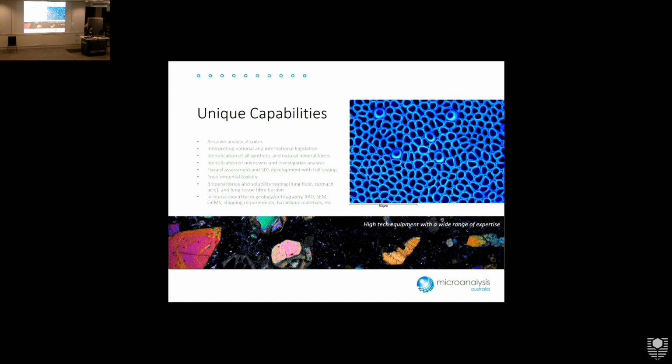And what else do we do? Hazard assessment, so SDS development. Environmental toxicity testing, and this is related to the next point, dissolution testing in different media. You can make up marine dissolution media or freshwater dissolution media to see whether your product is going to cause elevated levels of heavy metals if it was to enter into the waterways. And we have also done a few studies on biopersistence and solubility of fibers in lung fluids or stomach acid.